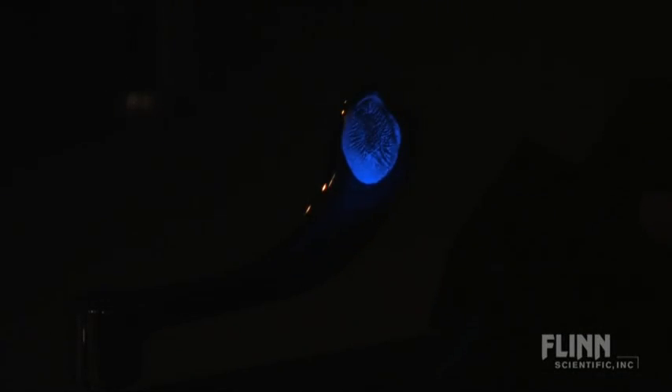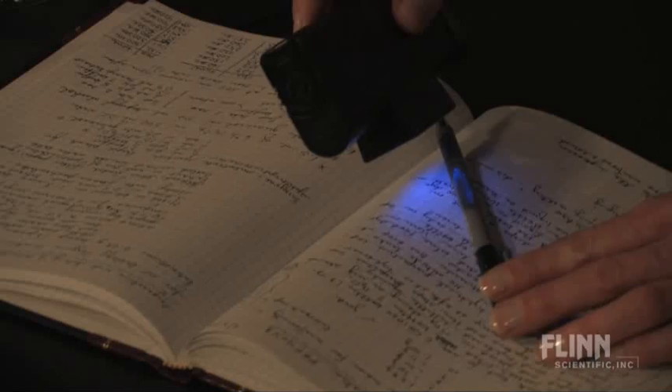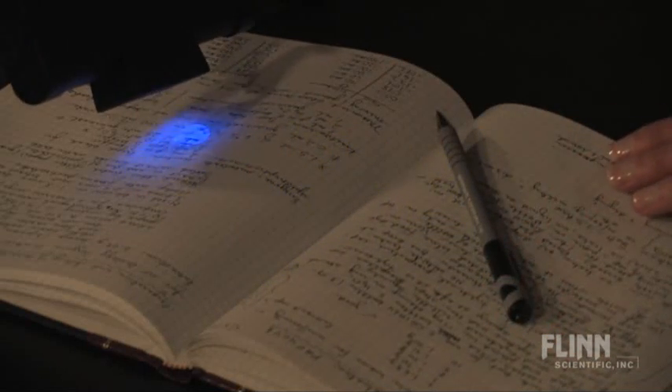Just before the end of class, turn off the classroom lights and turn on the UV lamp. Anything that has come into contact with the lotion will glow. Students will be amazed to see how far the contamination has spread, and they won't soon forget the importance of lab hygiene.